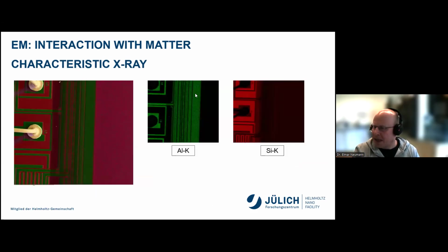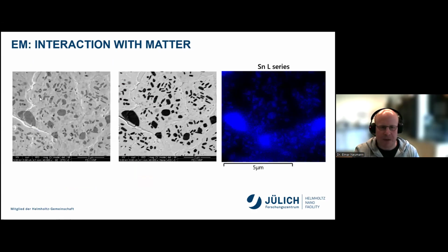Well, another from a technical sample here, different materials with different colors in this case in order to get this overlaid image. Here again, a comparison between all of these. You see first more topographic, then next more Z contrast, and here we can clearly say what elements we are talking about.